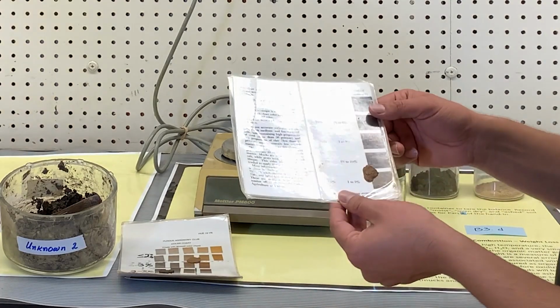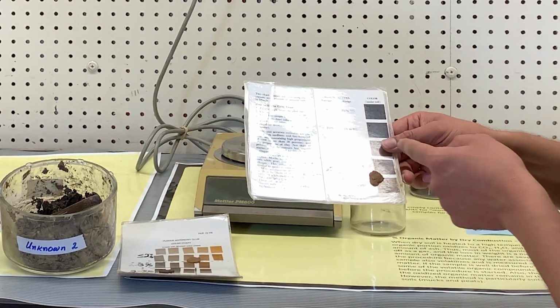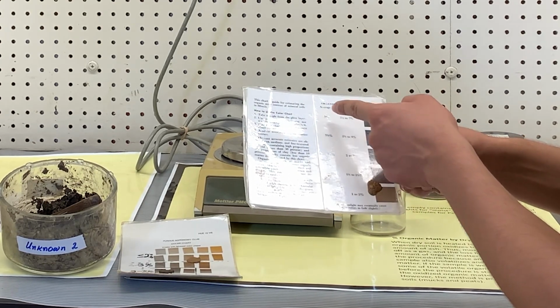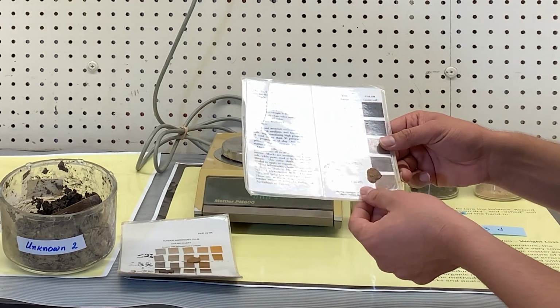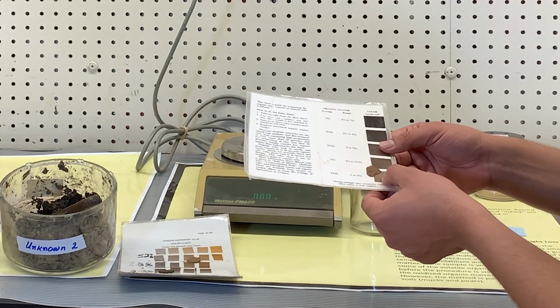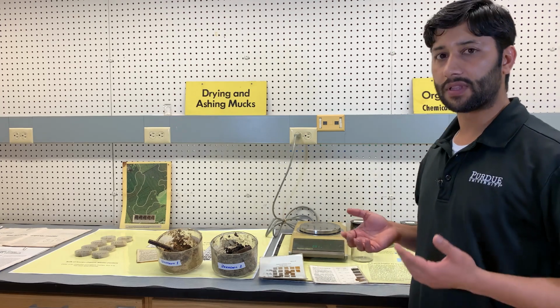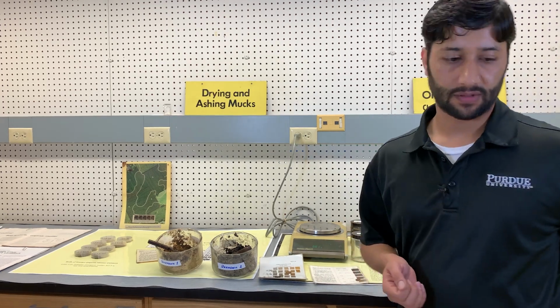This chart is developed by the University of Illinois, and they also have the same color scheme for determining the organic matter. They provided the average value for each color and also the range for each color. So based on that, our unknown sample number 1 is also classified under the less than 2% category here. So that is one way to estimate the organic matter content of a soil. We will talk about the next method.